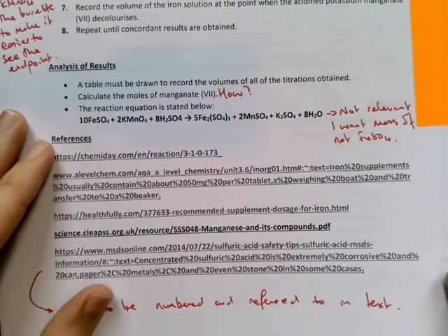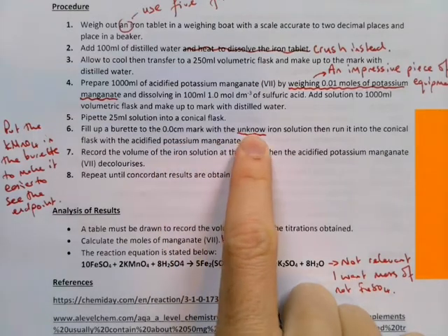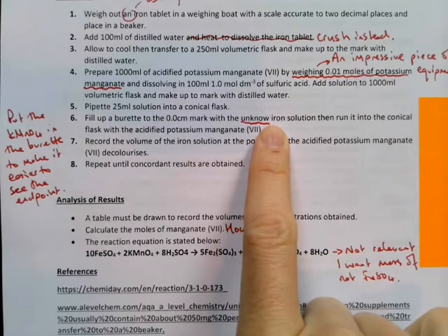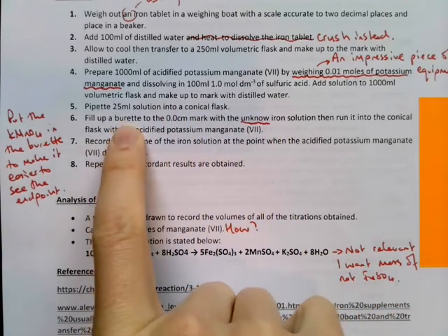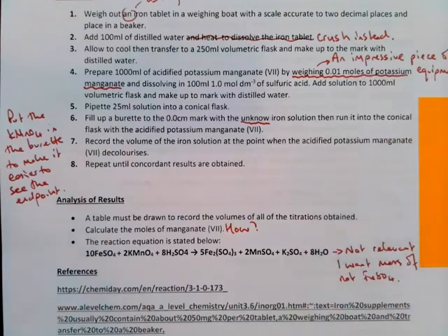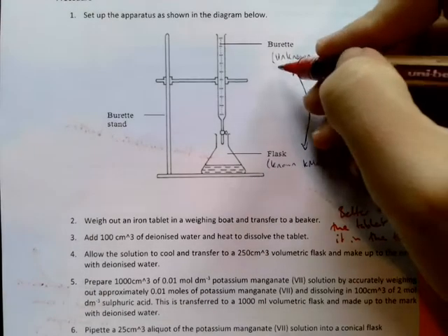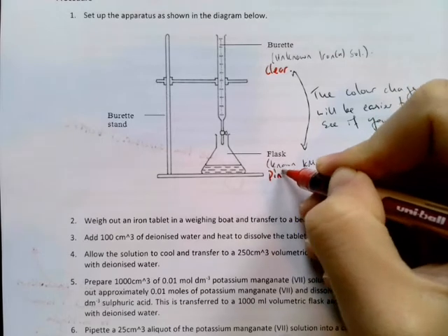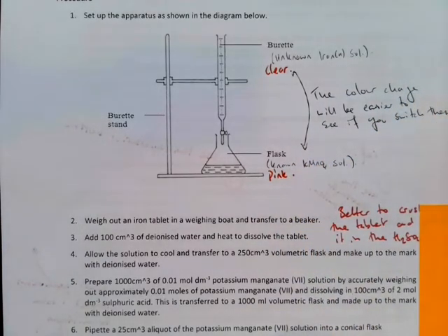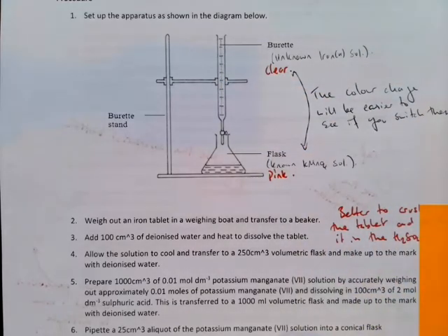Next we have here. So this person, they've put the iron solution, so the clear iron solution, in the burette, and the purple acidified potassium manganate solution in the conical flask. Okay, so you can imagine they're going to be titrating this clear solution into the pink solution. Okay, which is fine. With titrations, you can do it either way. The maths will always work. Because you pipette this, so you know what the volume is, and you measure this, so you know what the volume is, and you know what the concentration of one of them is, so you can always work out the concentration of the other one.